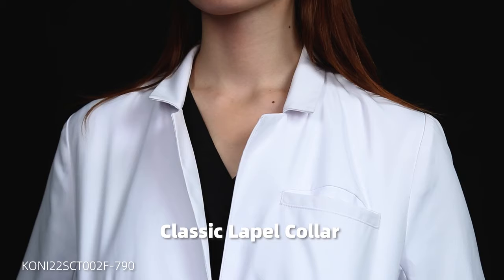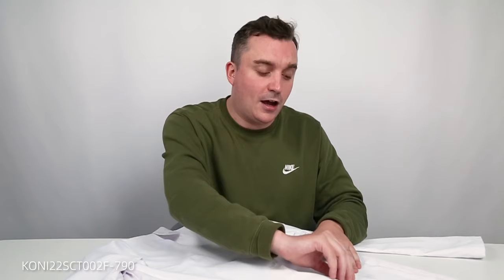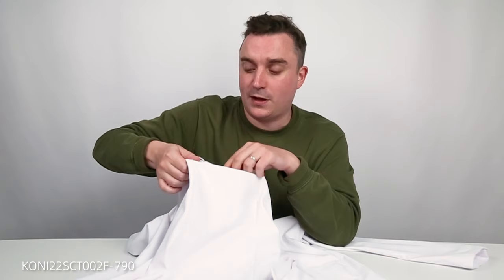Now we're talking about the details — there's lots to talk about here. We have this very stylized collar, kind of like a Czech collar, not like the usual collars. We have three buttons going down the front. On the left hand side we have a standard open pocket, and also an interior pocket for pens and notepads. On the right side there's a larger, deeper pocket. We also have a zipper pocket, and the interior of that zipper pocket has a webbed feel, which gives it a breezy feel so it won't get clammy inside.